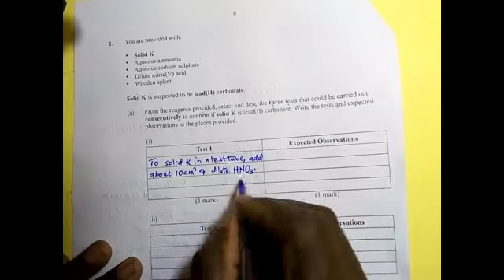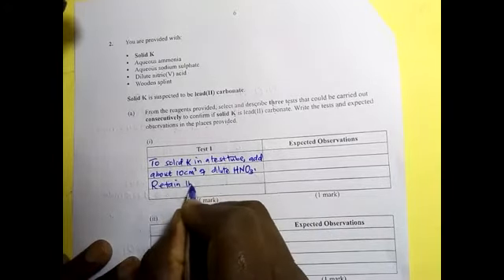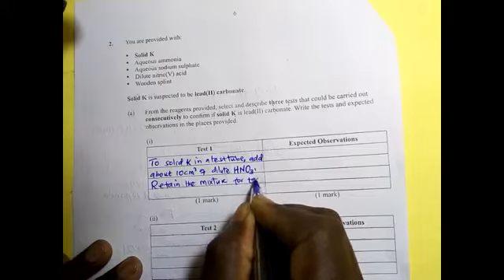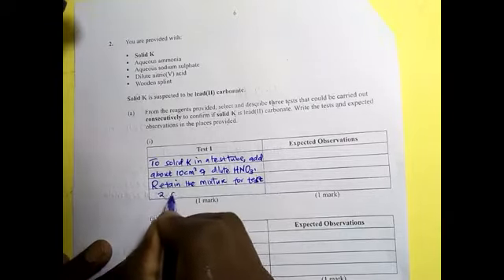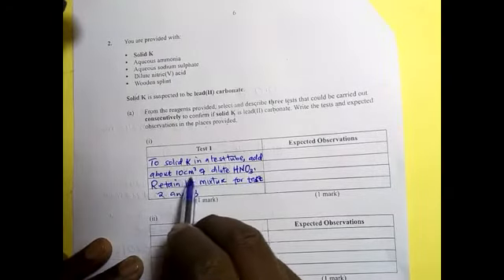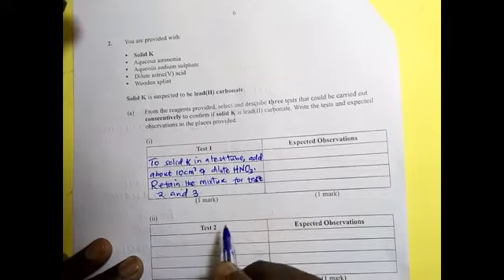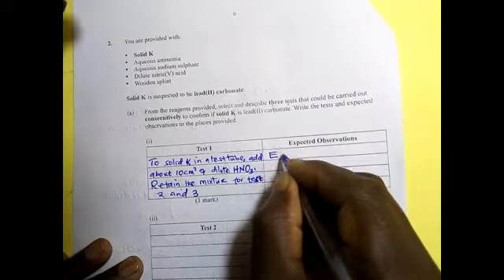You should state that you retain the mixture for tests 2 and 3. So when you added 10 cm³ of dilute nitric acid to solid K, what did you see? If indeed it was a carbonate, then you expect what? Effervescence.